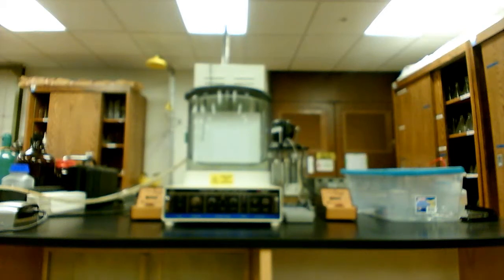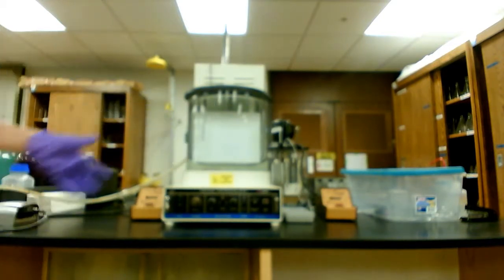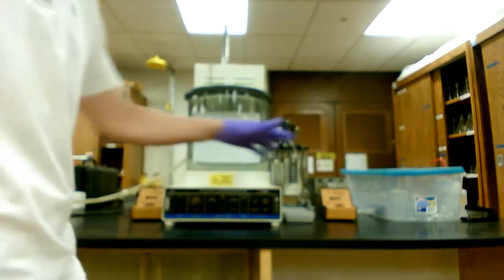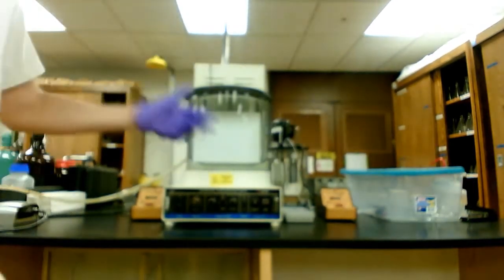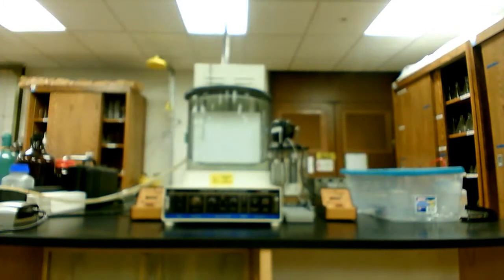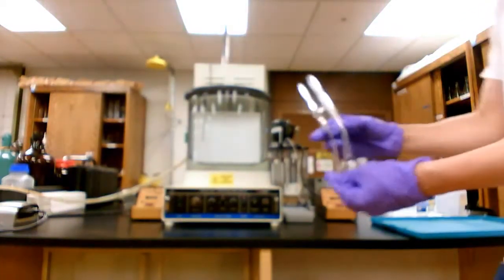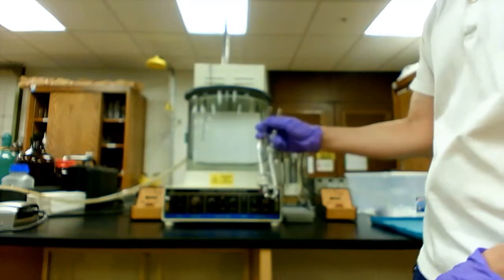In this video I'm going to show you how to measure the viscosity of some liquid using an Oswald viscometer. Our setup consists of a water bath, a timer to record flow time, a thermometer to check the temperature of the water bath, and the most important part is the actual viscometer, which is shown over here.